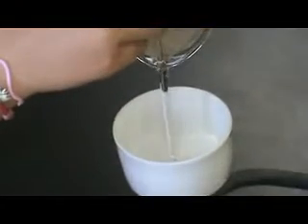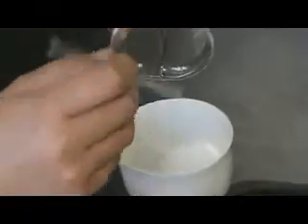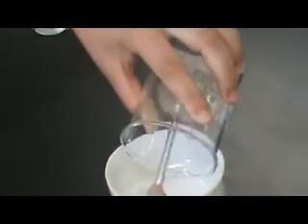Pour the contents slowly into the center of the filter paper using a stirring rod to help guide the mixture. When all the liquid has been filtered through, try to scrape as much of the precipitate into the funnel as you can.